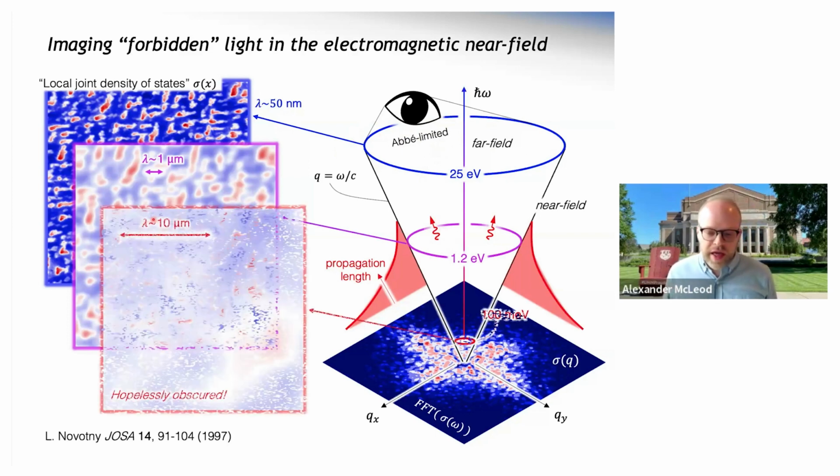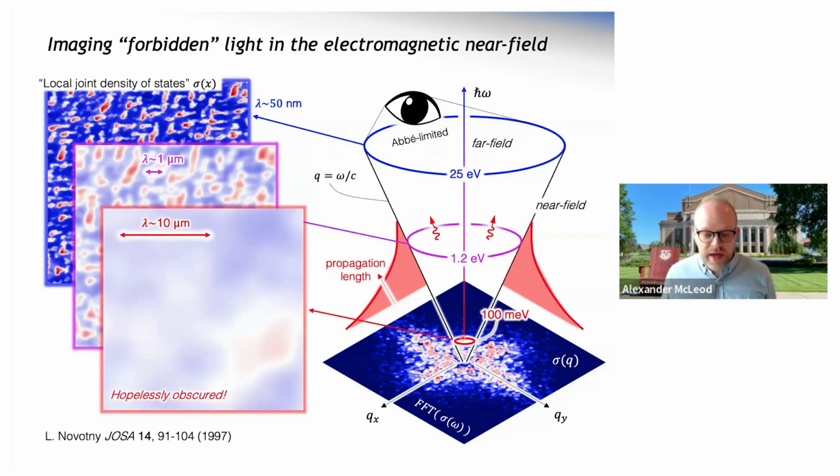And if we go down to the energy scale at which these phases are really actually different from each other, which is down in the infrared, there's absolutely no way, because we don't have enough information content inside of the light cone. So diffraction kills us. We can't see anything. So we definitely have to bypass the diffraction limit.